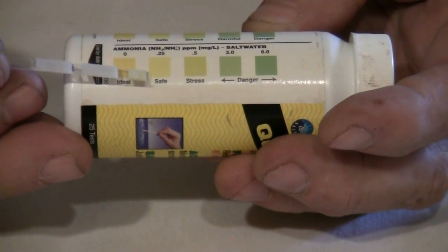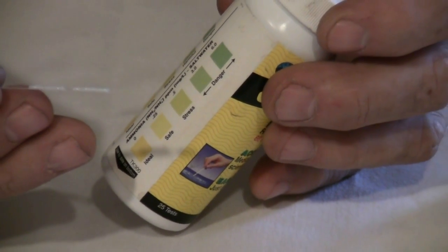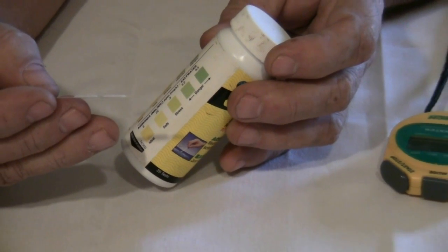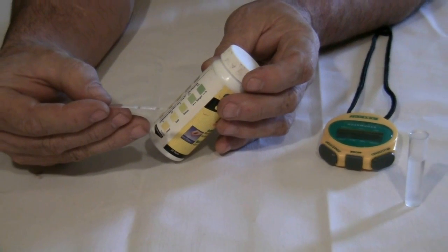If your ammonia levels are too high, do a water change and check your pH level and temperature, since both these factors affect ammonia buildup. Always follow the manufacturer's instructions on your test kit as times and color charts may vary.